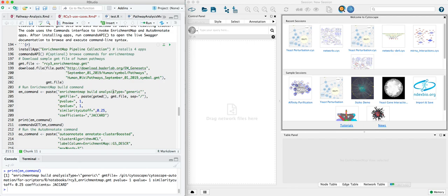The analysis type that we're going to do, the GMT file that we're going to use. In this case, we're going to use the GMT file for the full human WikiPathways collection. And then some cutoffs and parameters you can set. Again, exploring the documentation for enrichment map will explain these in more detail.